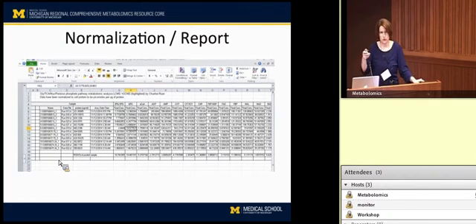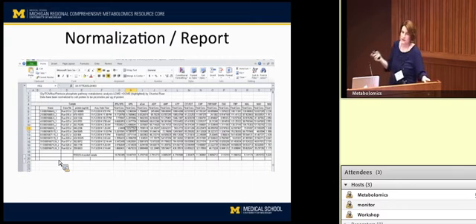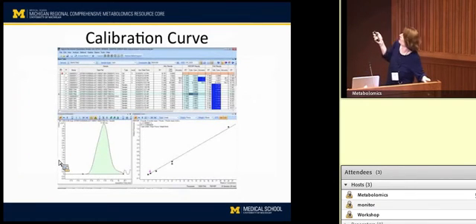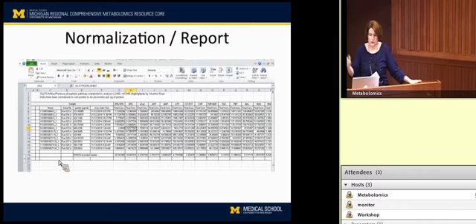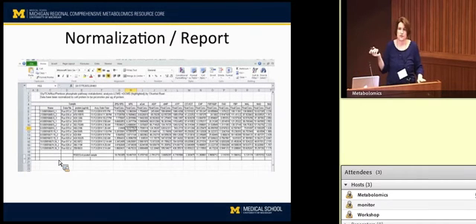And again, going back to the previous slide, this is going to tell us the precision of our measurements. It doesn't necessarily tell us the accuracy. The accuracy is back up here in this area, like how accurate was that number reported. Generally speaking, we don't report that in this report, but if that's something that you need to know, please ask us. We try our best to get that as close to 100 as possible, that we have run the calibration standards enough times to make a nice linear curve and that you're getting 100% accuracy there.